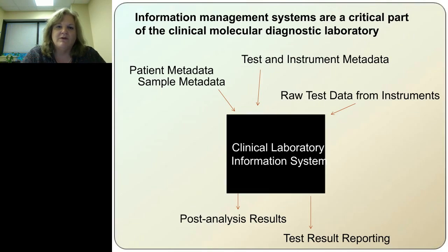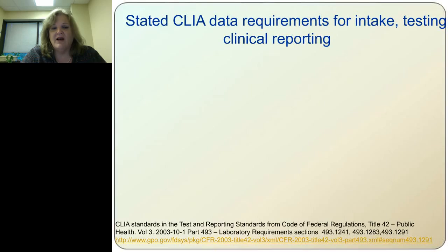And there's some sort of workflow and standard operating procedure that you've established for using that information system. But often people don't understand or are not aware of everything that goes on inside the box, both in how data is managed, how quality is assured, and how the data integrity is maintained. And currently, there aren't actually a lot of regulations around what actually goes inside that black box. So there's a lot of regulations surrounding the information that goes in and comes out.